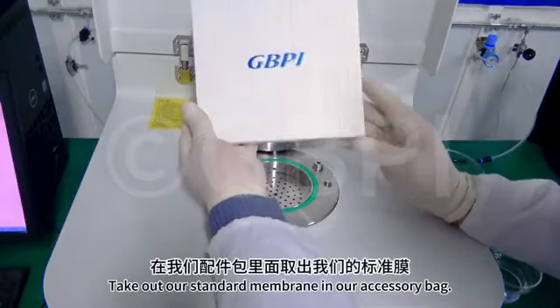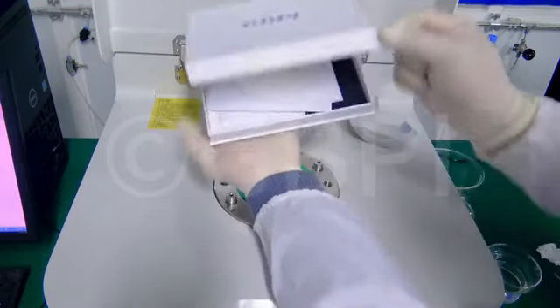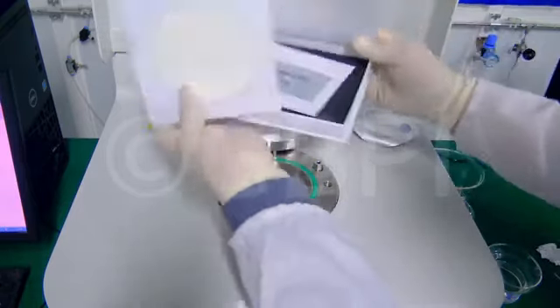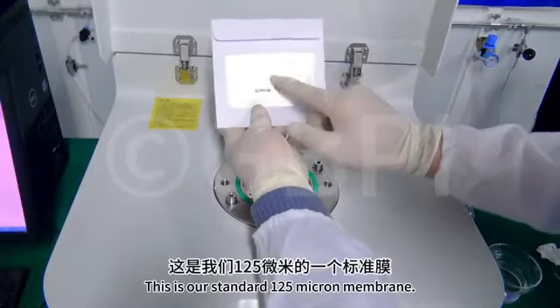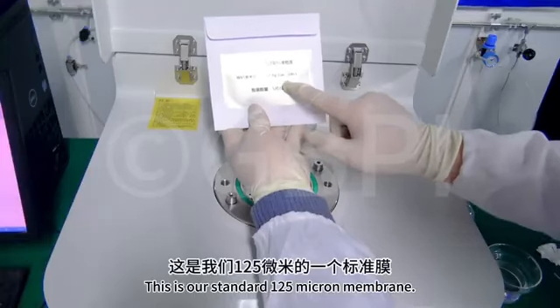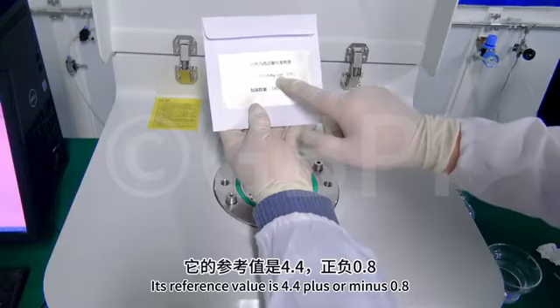Take out our standard membrane in our accessory bag. This is our standard 125 micron membrane. Its reference value is 4.4 plus or minus 0.8.